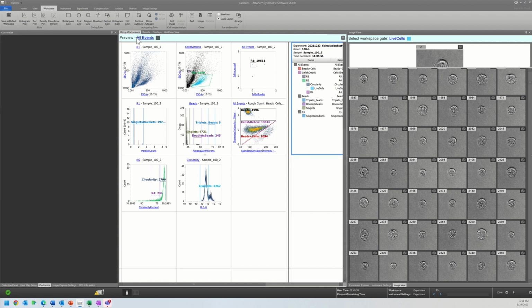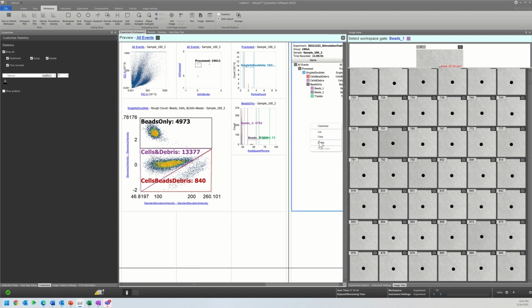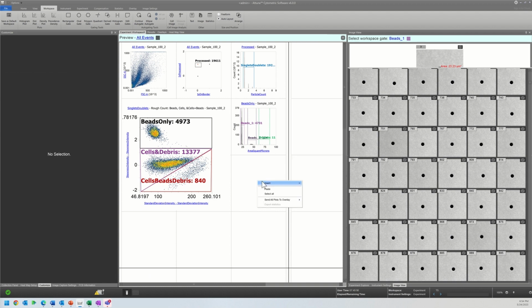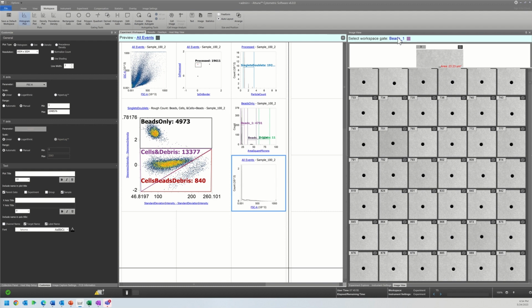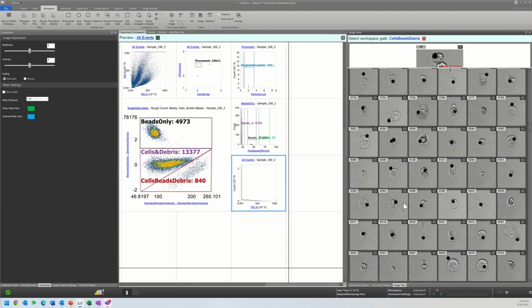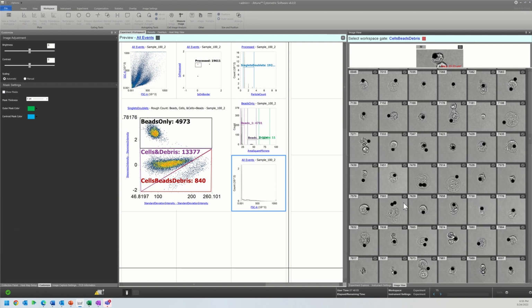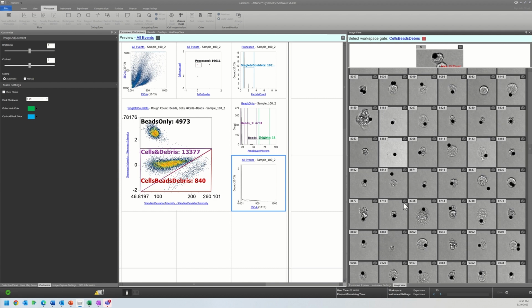So let's come here to the experiment workspace. I'm just adding a new one, and we're going to use a lot of the same parameters to do this. One of the challenges when we are looking at interactions in complex samples is determining what events are coincidental.